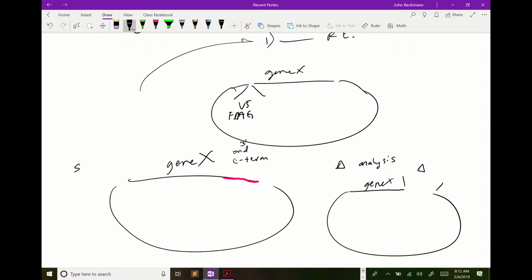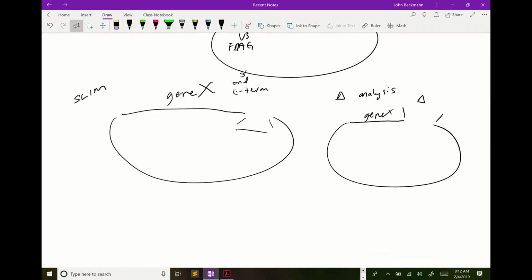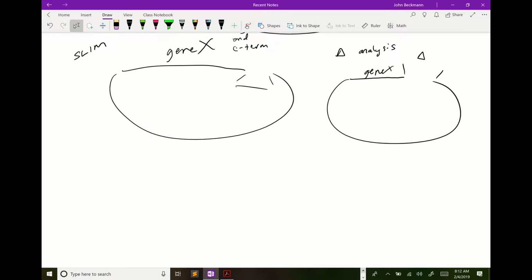So SLIM is a way for you to do that. It's a way for you to get rid of, erase that sequence that was right there. When you have knockout animals that have a gene that's been deleted for the same reason, is this the same method?